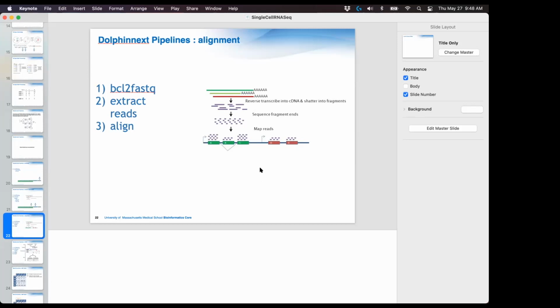Obviously, you can't have 5 kb fragments on the sequencer. All the clusters will bleed into each other. So you do fragment, but after fragmenting, you're throwing away most of the material, and you're just keeping the 3' end that has the UMI and cell barcode on it. 10x and other techniques have 5' biased libraries, so you're not necessarily tied to the 3' end.